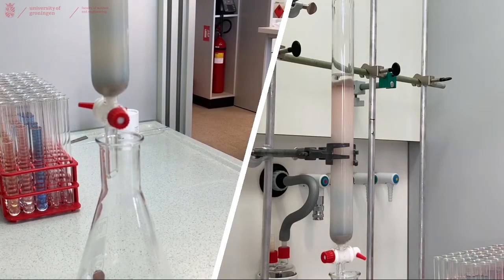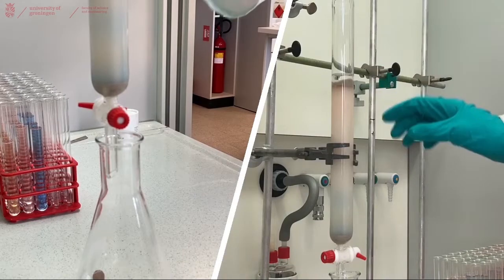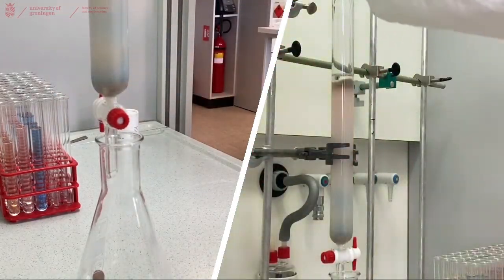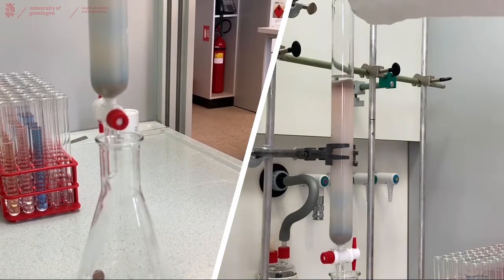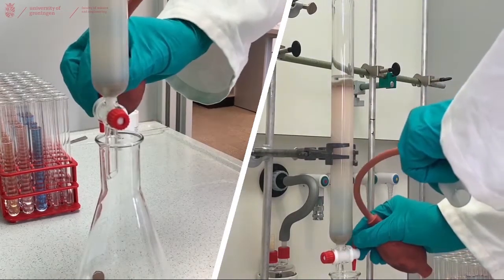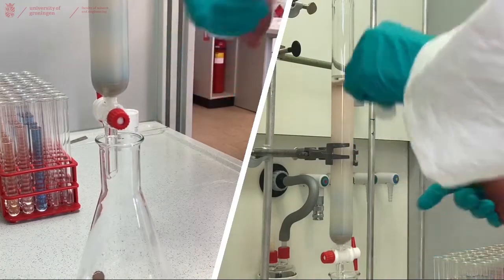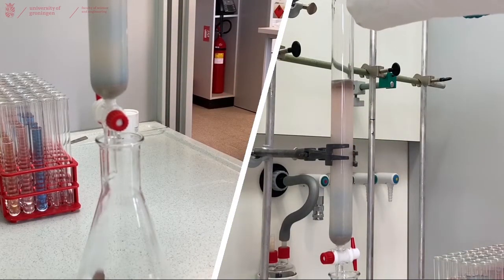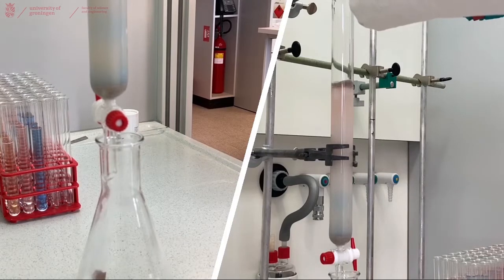When you're sure that you have your product isolated in your flask, you can empty the column by opening the tap and pushing out the liquid using the balloon. Make sure that you collect this liquid in an Erlenmeyer for the one case that you actually did not isolate your product yet.